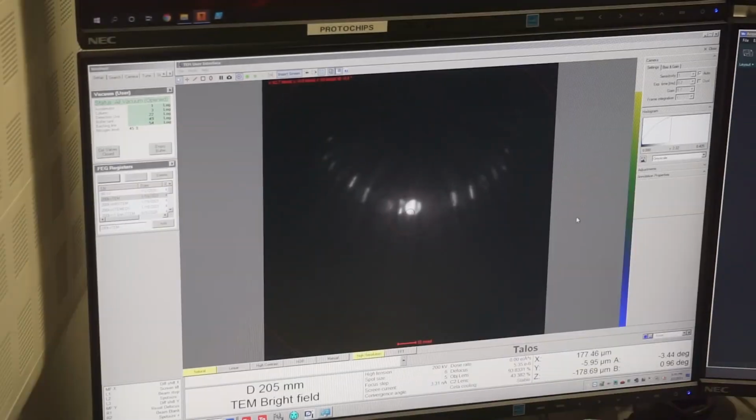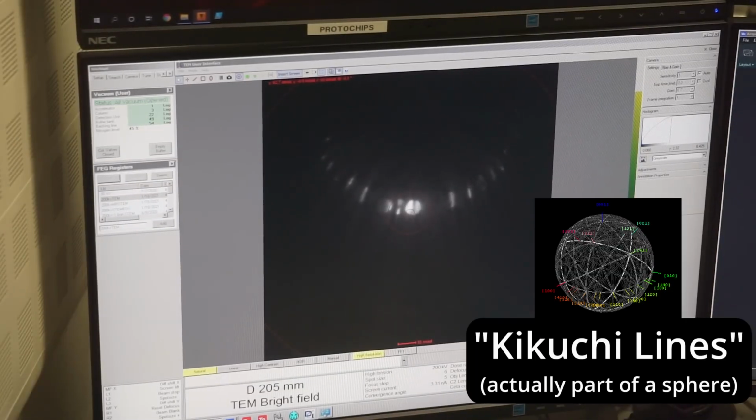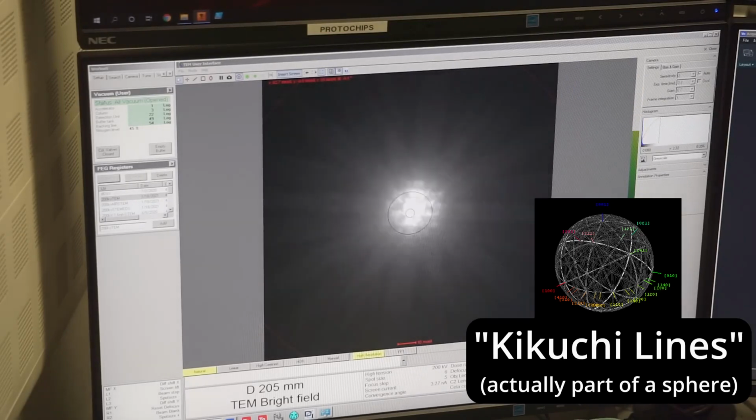So we've got this awesome starburst pattern called a Kikuchi pattern, and we basically just want to line this up so that we're looking at the center of this starburst, which is called the zone axis. Make it look real starbursty? Not really. The sample might be a little thin for that.